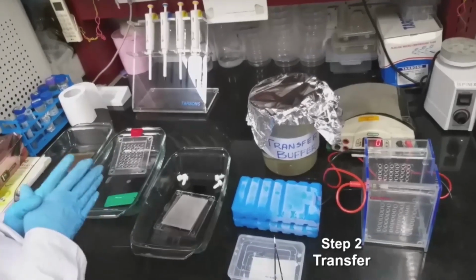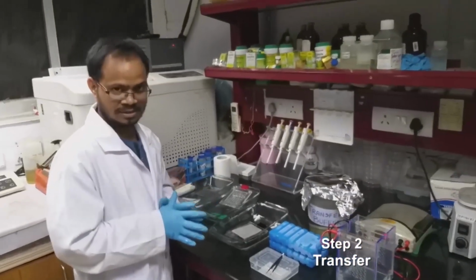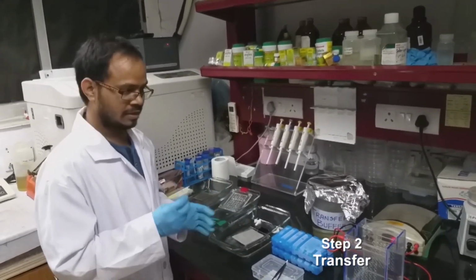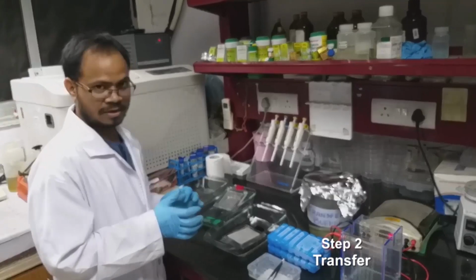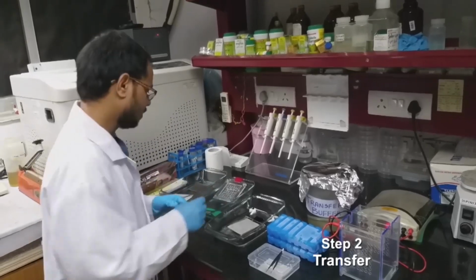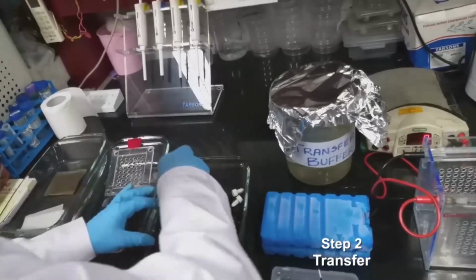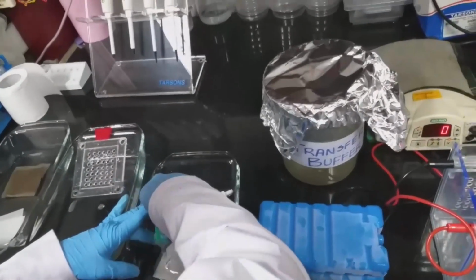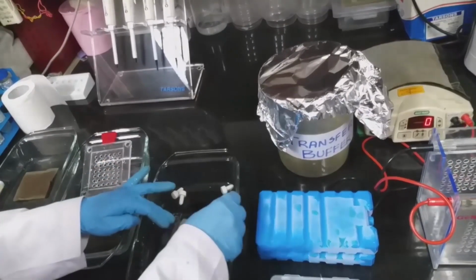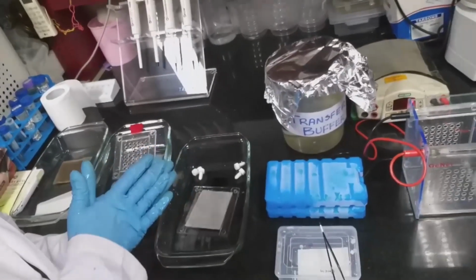Here we have to remember that after finishing the SDS-PAGE run, you have to keep the gel in transfer buffer, so that it gives identical conditions, an equilibration of sorts, during transfer, so that protein transfer may be easy. So this is the gel, and we keep it on the negative side. After that we have to overlay with the membrane.